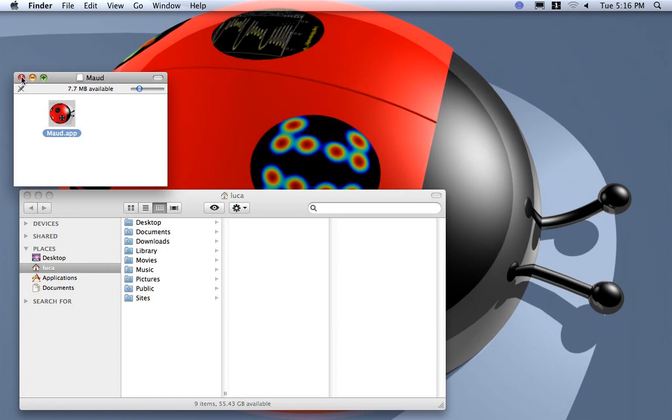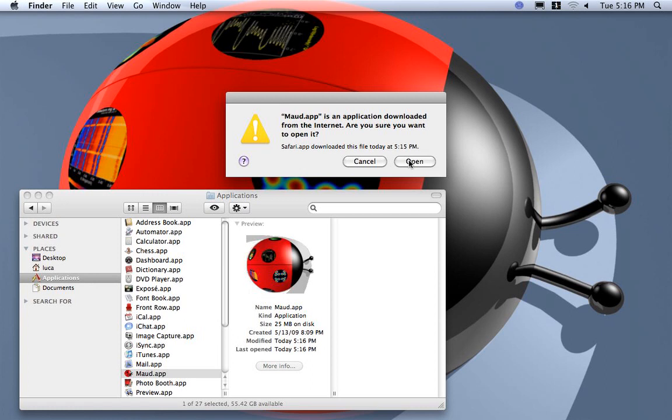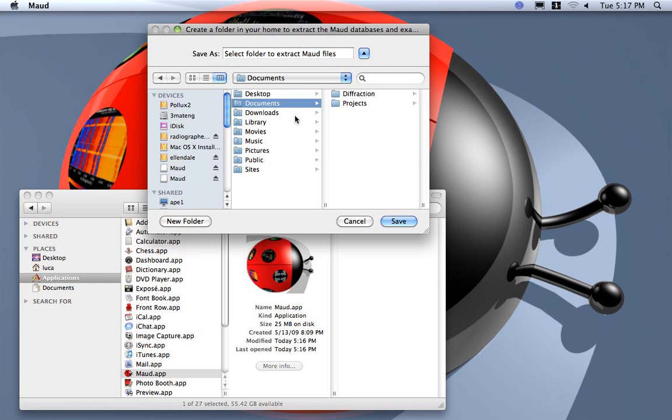For Linux and Windows you just extract the archive and put wherever you like the program. Now the first run is particular for Maud. It will ask to create a folder or directory where Maud needs to extract some files, some reference files, some examples, some database.